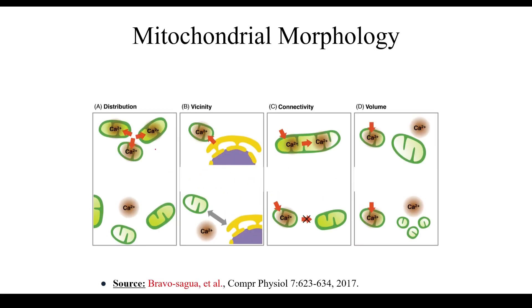Hello everyone, welcome to this video tutorial. Today I'm going to dive into the fascinating world of mitochondria. I will be showcasing how to do image analysis using ImageJ, which is a very powerful open source image processing program designed for scientific multi-dimensional images.